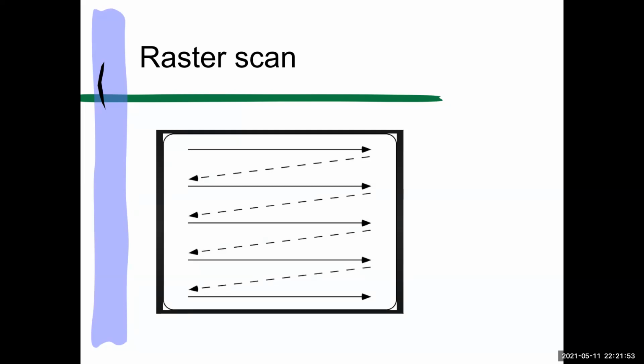And you can see this as you're watching. Your image will appear in lines. It will sort of scroll down. You'll have the top of your image, and then it'll just sort of unveil itself on the screen as you're watching. And so you're collecting data usually just from the one direction, although it's a whole thing about whether you want to get the return also. And this is just for one image, for one plane of focus, for one color.